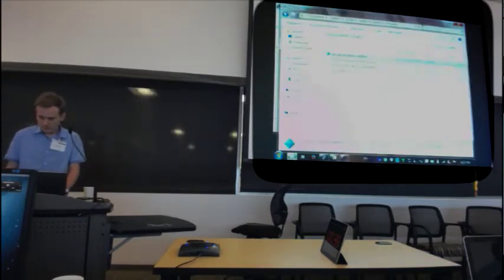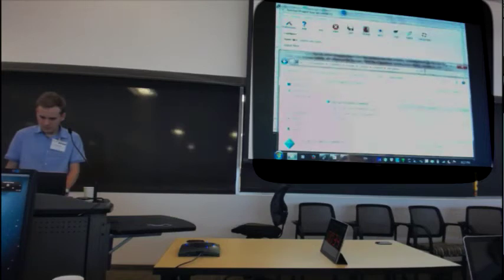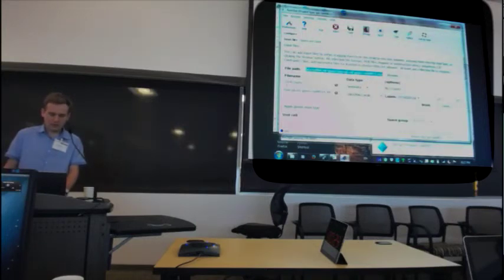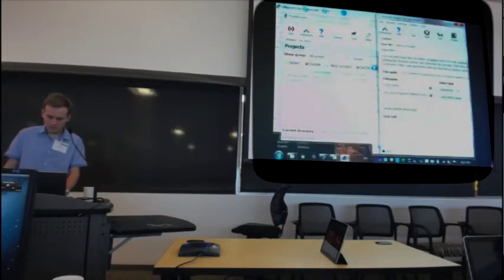You can load this MTZ file by dragging it from here to there. You also have to input the sequence file for lysozyme, which is S1 EDS, for example. And the wavelength for this was, I forgot.